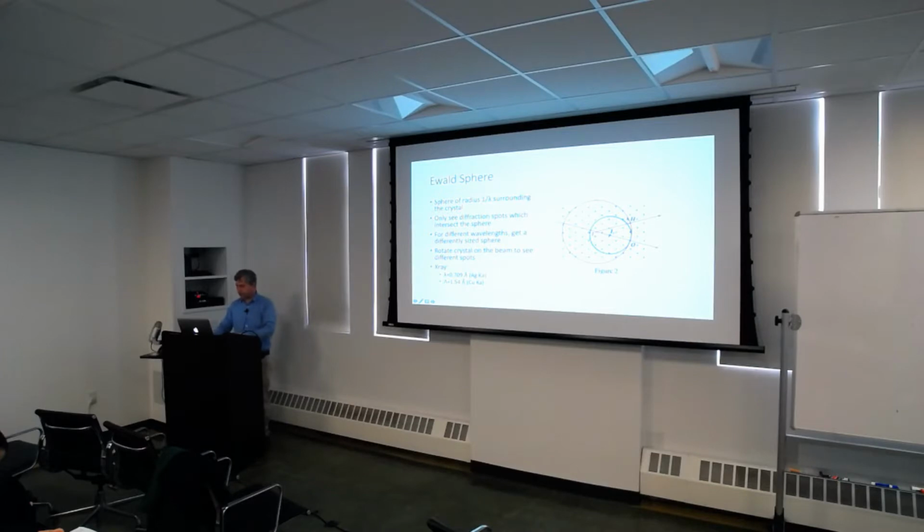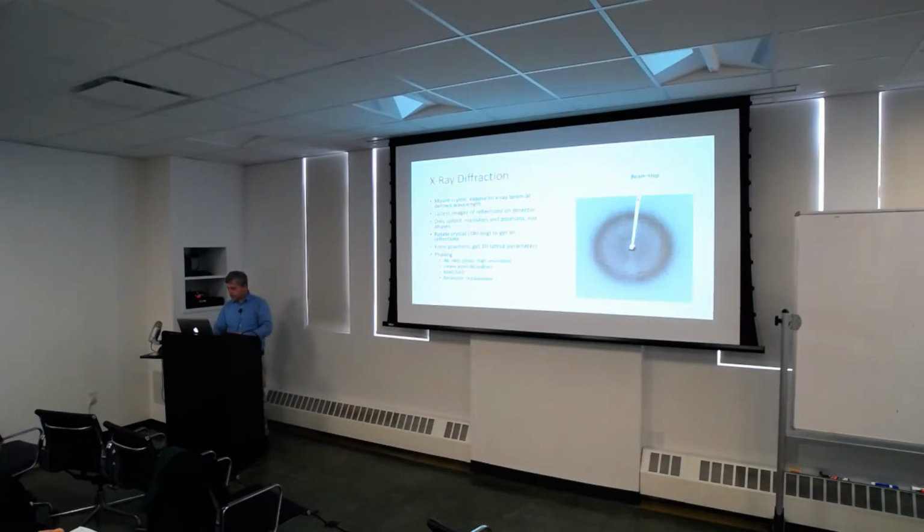And that leads to these curved lines of diffraction spots, because the interaction with your detector is basically a plane, and that's interacting with this 3D sphere, and so the interaction of the plane with a sphere is a circle.